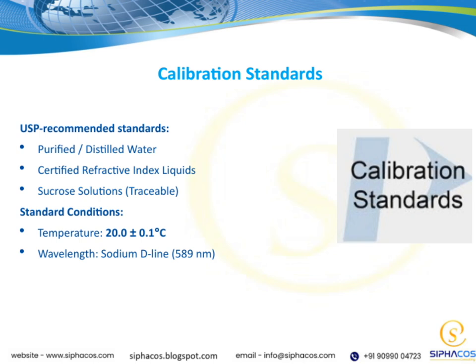All these standards and conditions are crucial because they ensure our measurements are accurate, reproducible, and comparable across different labs and applications. They tie back to our overall goal of maintaining high-quality, reliable analytical results.